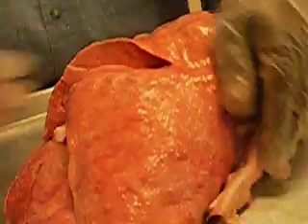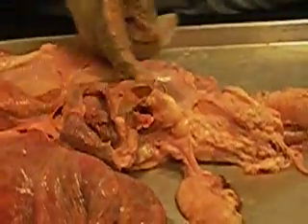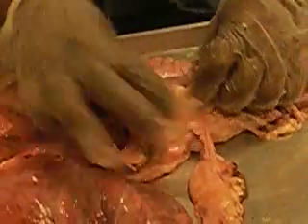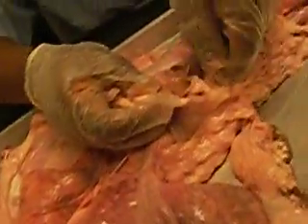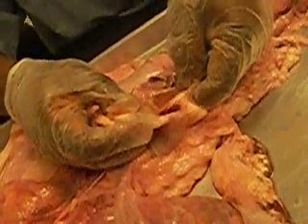No, that's not the one. See that? No, that's the descending aorta. On this one here, you can see, look at that. Look at the size, look at how the aorta looks. It's thick compared to the pulmonary. Make sense? When you open this, look at the difference. That is the aorta. It's thick. Why is it thick? Got to pump to the rest of the body.